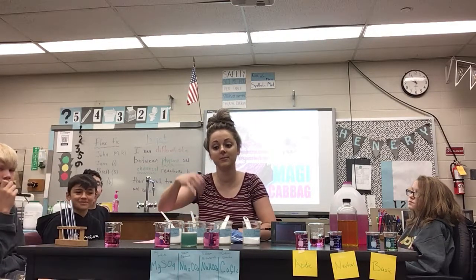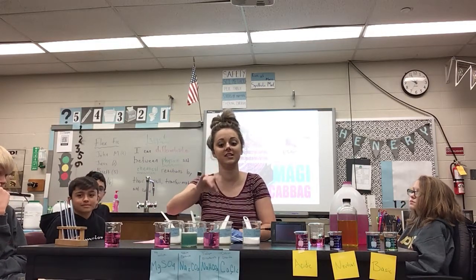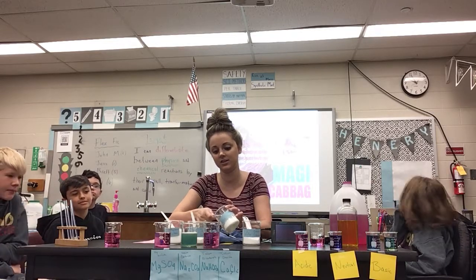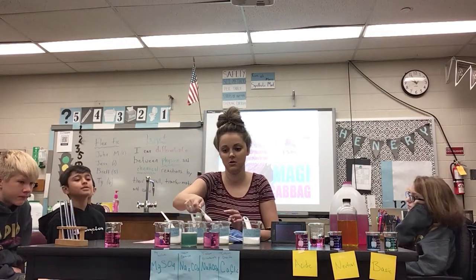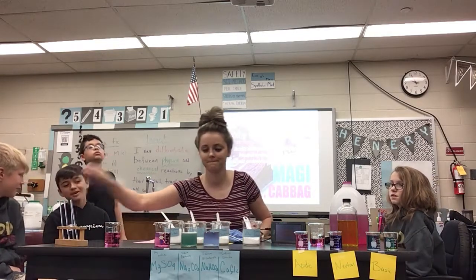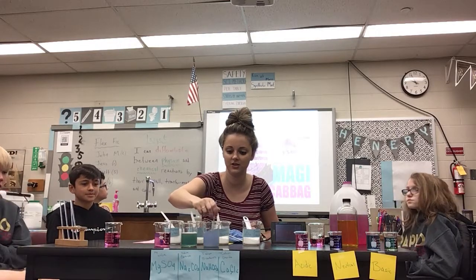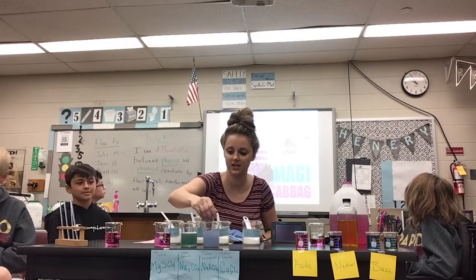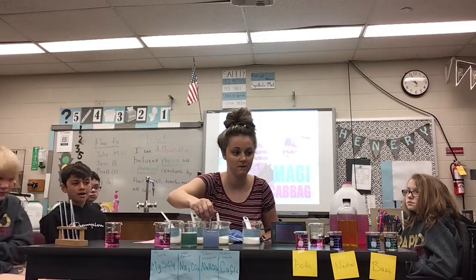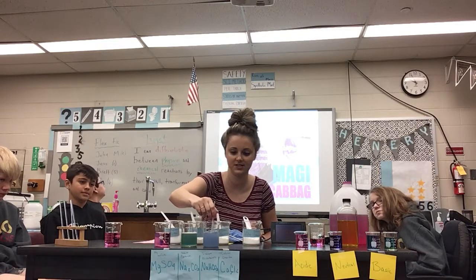All right, now that was sodium carbonate. This is sodium bicarbonate. Slightly different, but not much. Let's see what happens. Again, I'm gonna make sure I equal this out. Ooh, that's pretty. And we stir it because we always want to make sure that everything is stirred in. Will they clear up like how those got clear? Over time, everything will start to settle.